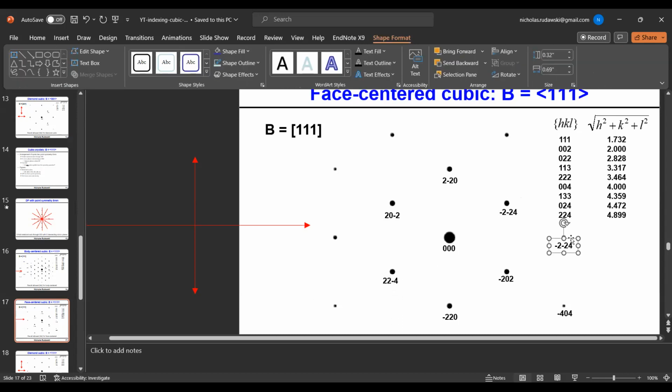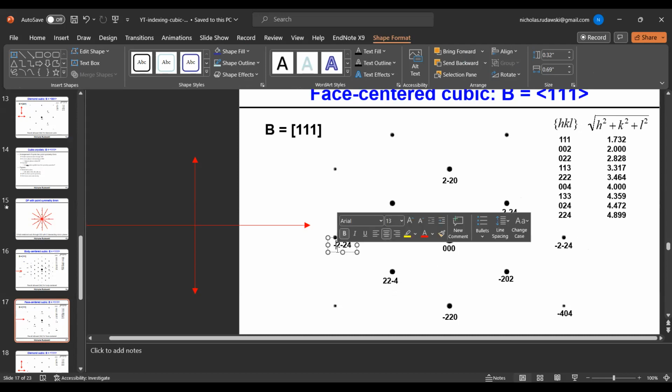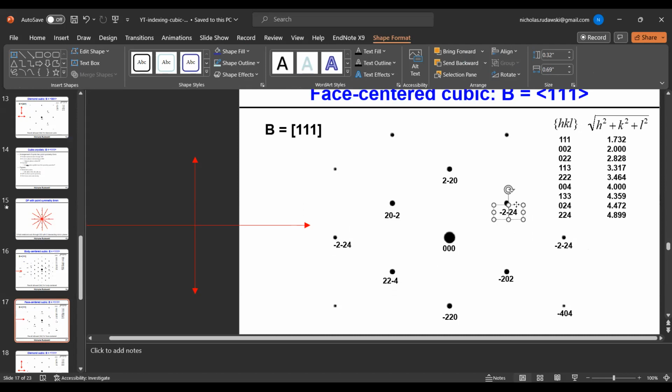and we'll do one more here. It's just the opposite of this guy. Okay, which is, oh, whoops, did I mess that up? I did. Yes, I messed something up here. No, this wasn't right. I was going to rewrite that as something. Yes, this should be the opposite here. So this should be, my apologies for that. That is correct there.